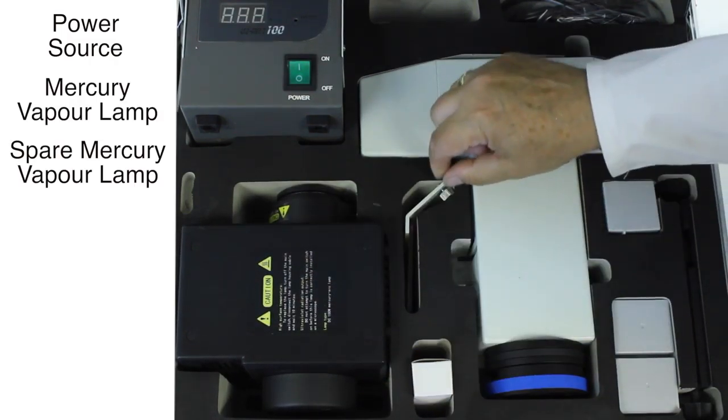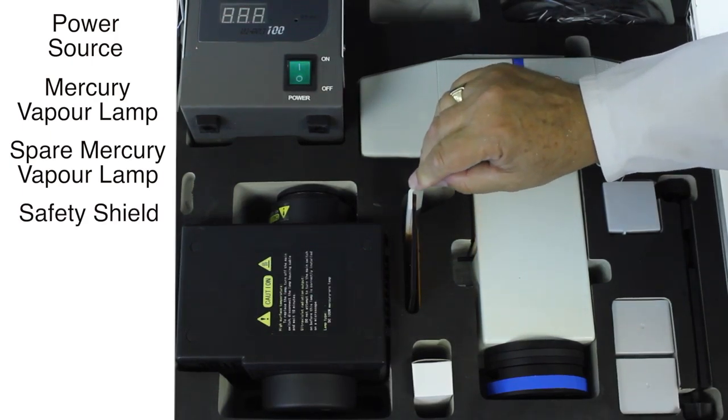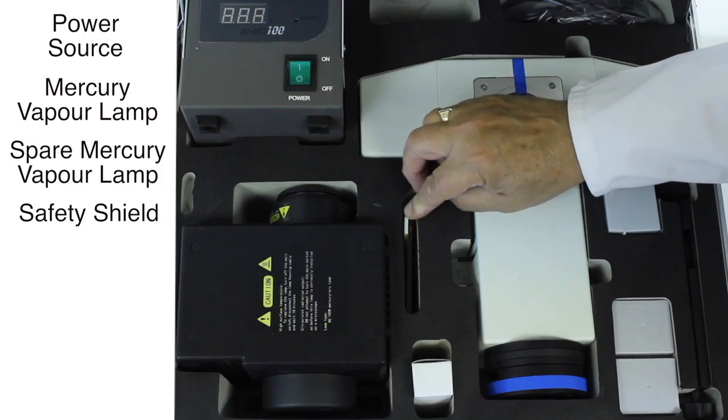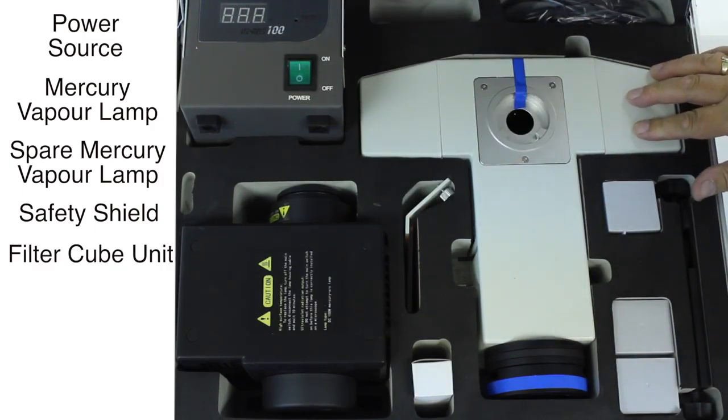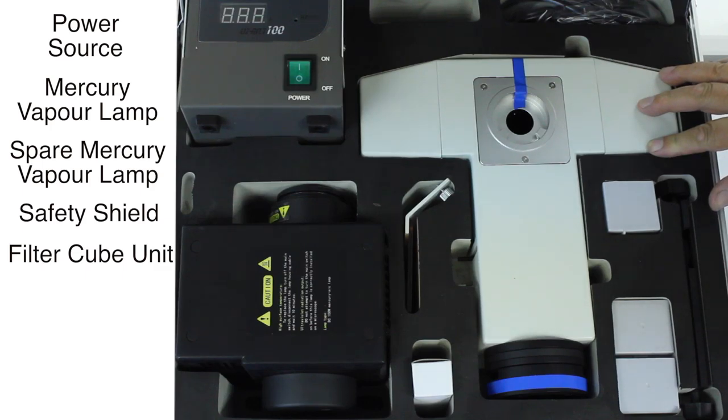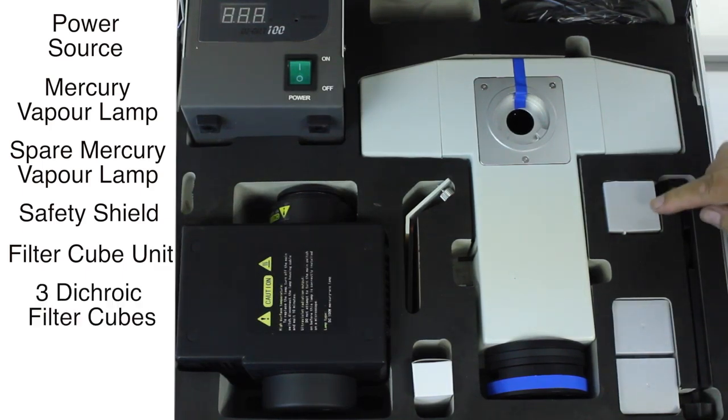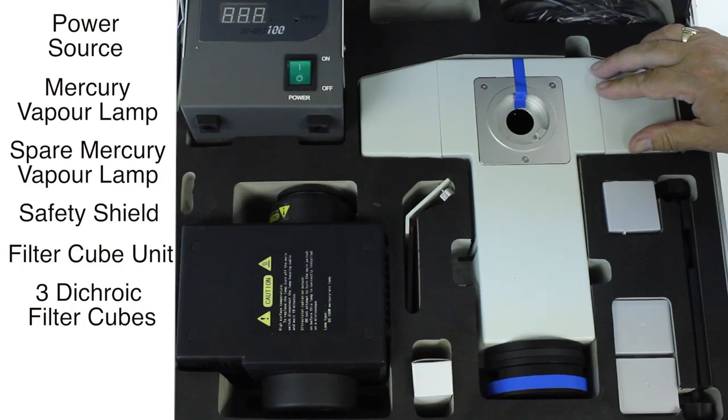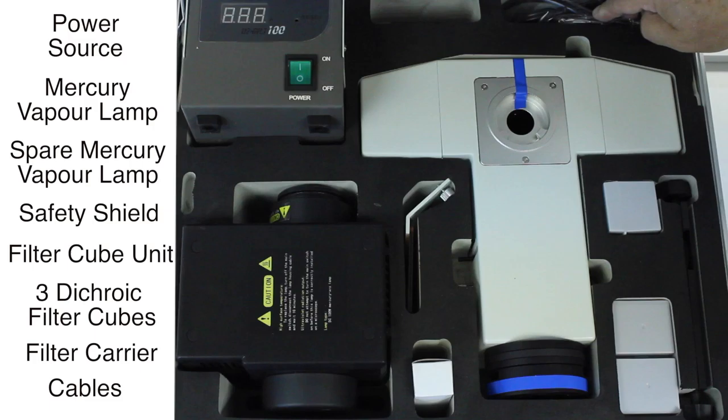It's a spare mercury vapor lamp, and there's the safety shield to prevent operatives getting ultraviolet light in their eyes. This piece here is the incident body that houses the dichroic filter cubes, which are in these three pots, although probably they will have been fitted into this component for you. Then there's a filter carrier here and the necessary cables there.